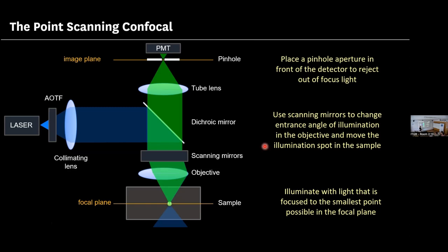You'll be able to control how many points and what's the distance between the points in a field of view that's dictated by the objective magnification. And that's one of the main advantages of the confocal. Whereas on a camera system, you have a camera with a given resolution. You may have additional optics, optovar elements, to magnify or demagnify the image. On the confocal microscope, you can actually choose what's the number of points that you scan in the sample and what's the distance between them.